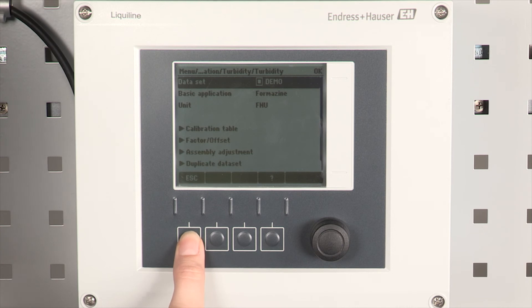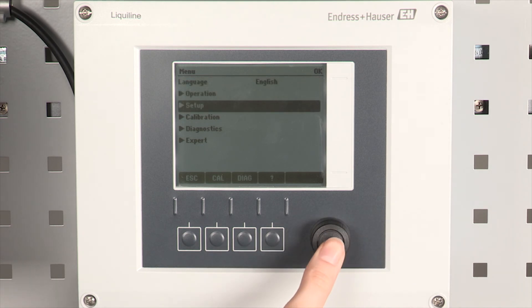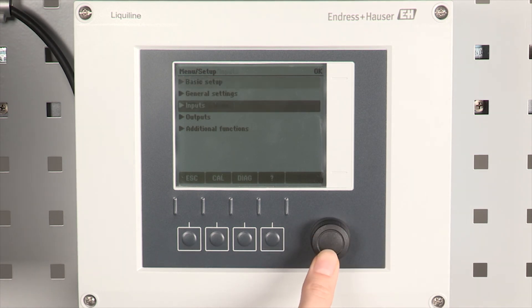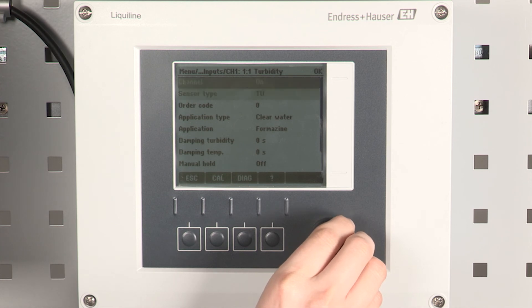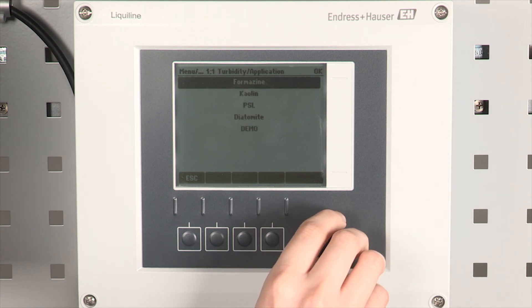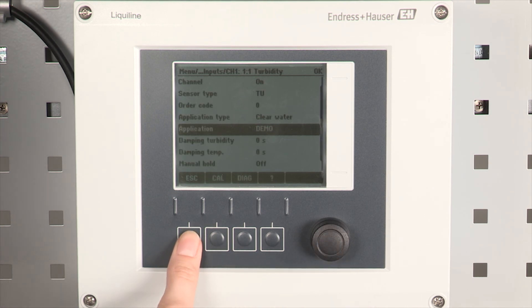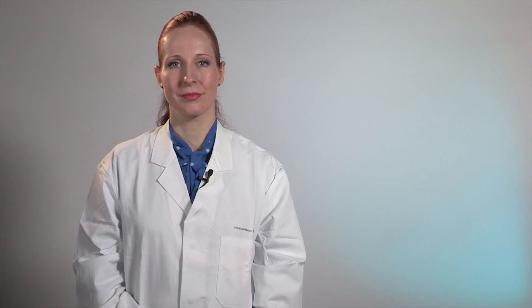Then we have to activate our data set. For that we leave the calibration menu and go to menu, setup, inputs, your sensor channel. Under application select the new data set for activation. Finally press and hold the escape button until the device jumps back into the main measuring screen. Now with the activated assembly adjustment the device shows the correct measuring value and therefore we are finished with the commissioning.